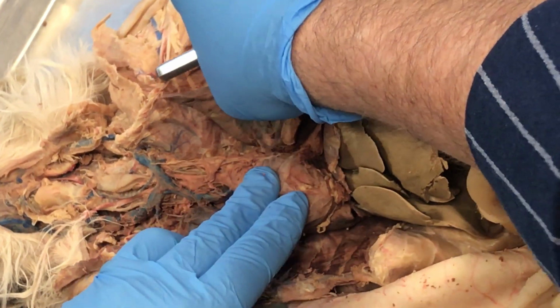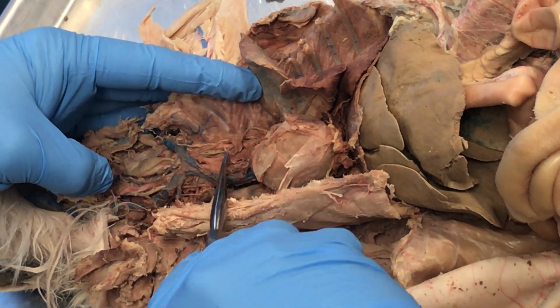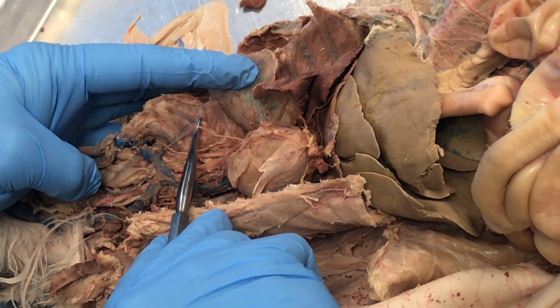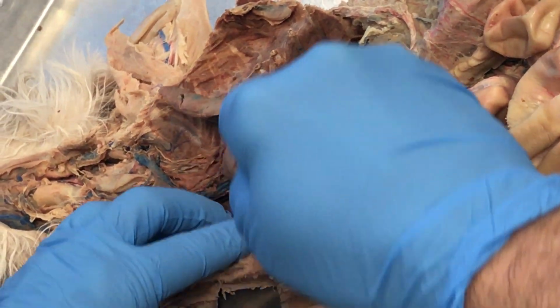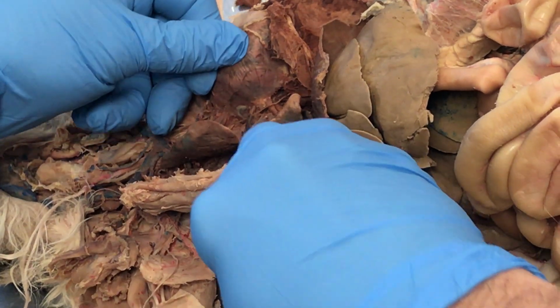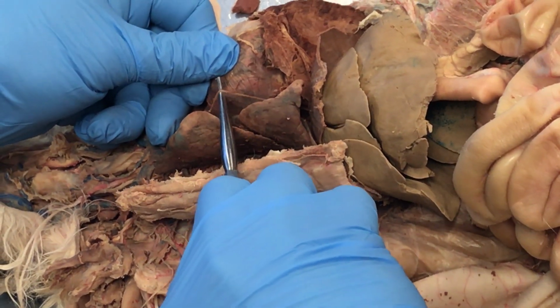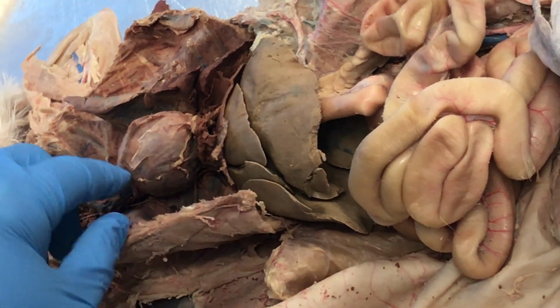The phrenic nerve continues down, and I can see a little bit of it. I think I can see it right here. Yep, there it is. So the phrenic nerve is this little bitty nerve right here that goes down. There's two of them. There's one that goes down on the left side, to the left side of the diaphragm, and then there's one on the right side, which is, no, they did dissect it out. So the other one coming down is going to be this dude right there. So that's phrenic nerve on the right side. Okay? And of course the lungs. Lung.